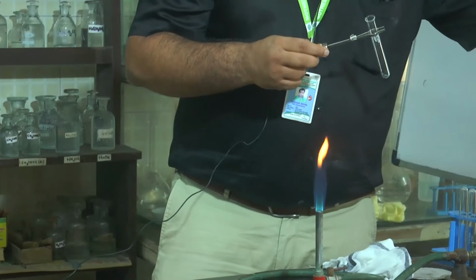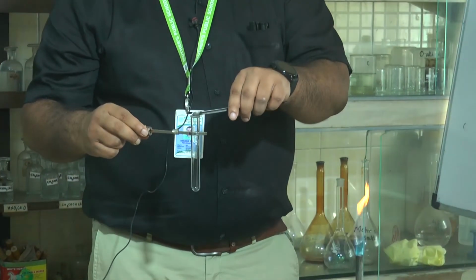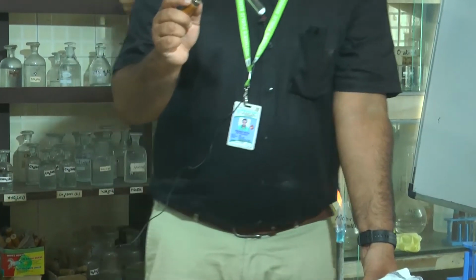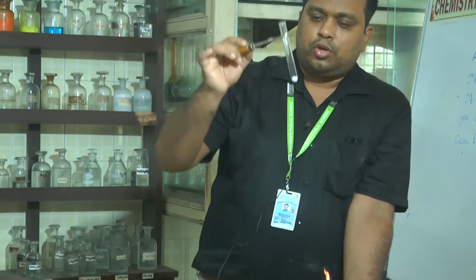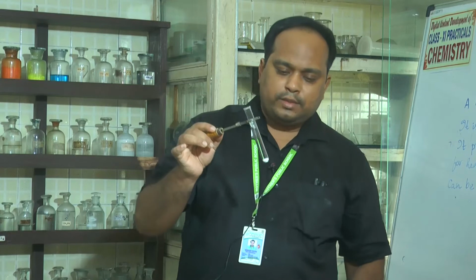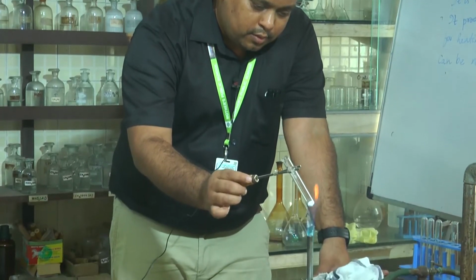Then you have to take a pinch of salt. I don't know which salt this is; we have to see which salt it is. So I am taking a pinch of salt here, and I am just heating this. While heating, you have to observe what is happening. Is there a sound? Is the salt melting, or does it decrepitate, meaning a crackling sound? Otherwise it will sublimate. Let me heat it. I'm just heating this.